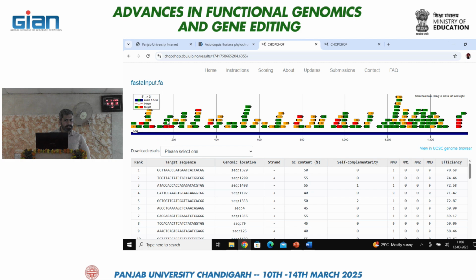We are not representing it. The software is doing it itself, as we have initially taken the CDS. Here we can also take the genomic sequence as well. So based on that, it can differentiate between the exons, introns, and that part.